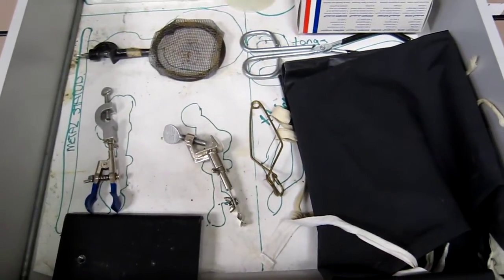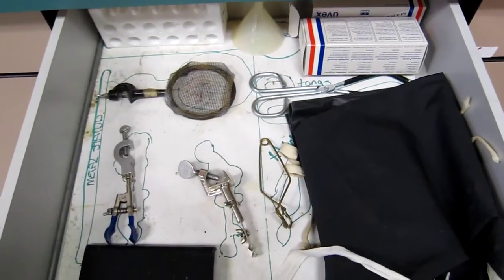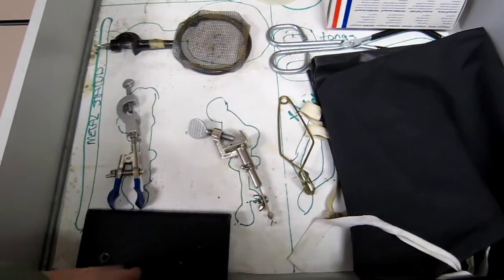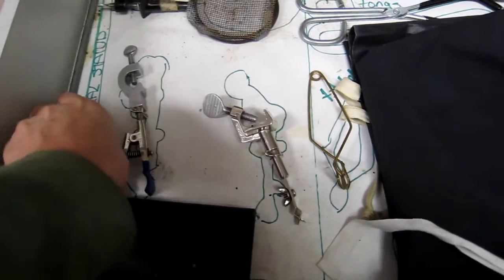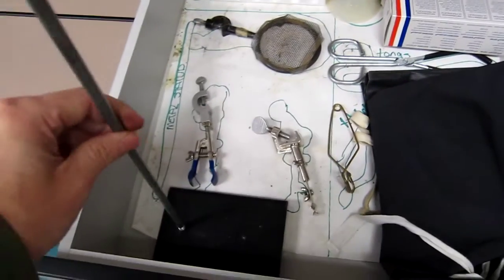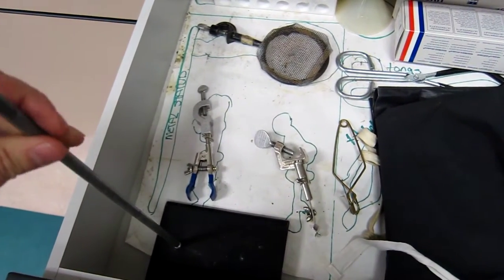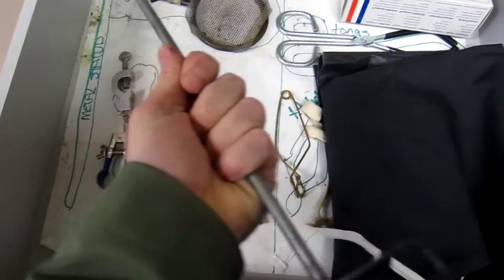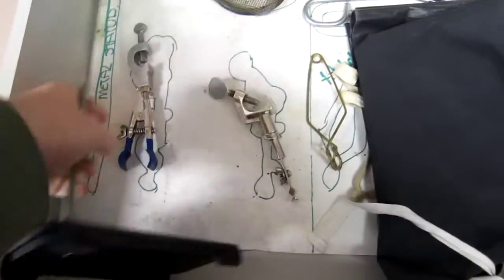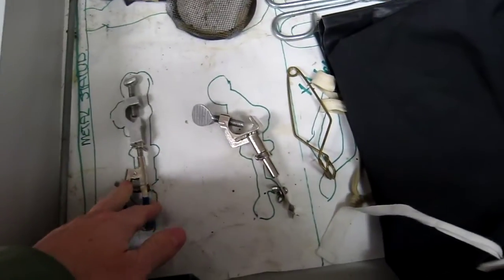Couple things. This is your lab drawer, and I do expect it put back neatly. I'll give you a quick tour here. This is part of your ring stand. This will come out, and this can be screwed onto here. And actually, this one was already disassembled. Most of your lab drawers, you can keep it assembled and just keep it over in the corner like that. Everything has a picture, so it tells you where to go.